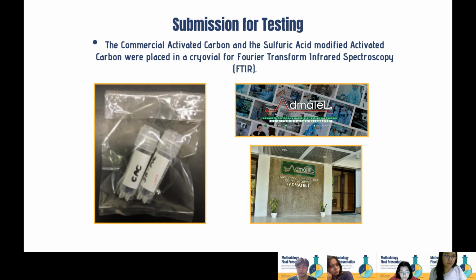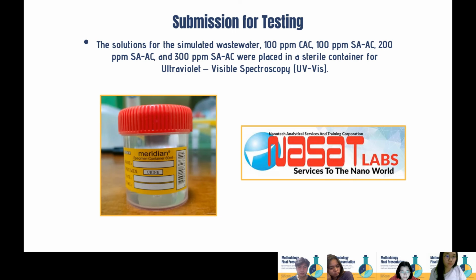Next slide. Also, the solutions for the simulated wastewater, 100 ppm CAC, and 100 ppm, 200 ppm, and 300 ppm SAAC, were placed in a sterile container and submitted to NASAT Labs in Cabuyao for UV spectroscopy. Also, the results will be released after 10 to 15 working days.